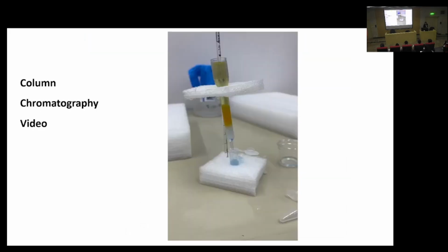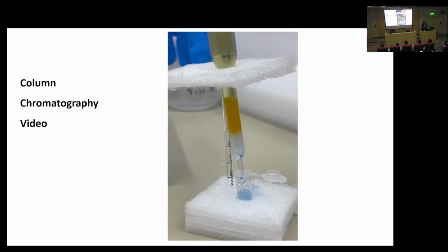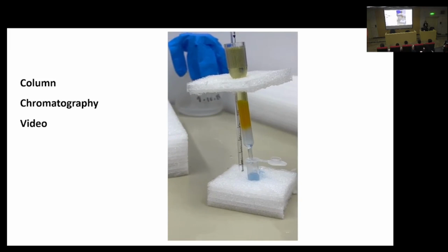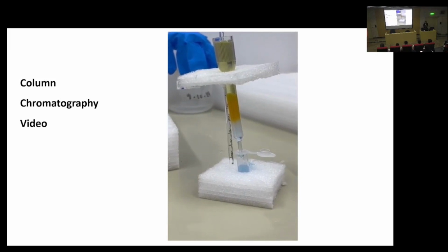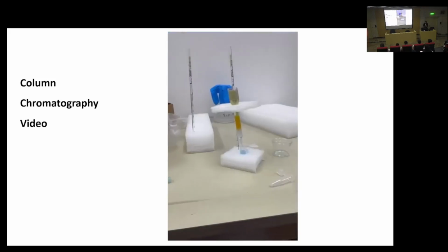We have a video here, you can have a look. All right, there you go. It'll look something like this, but as you can see, the dripping of the solution is taking a long time, and therefore it might be time consuming.